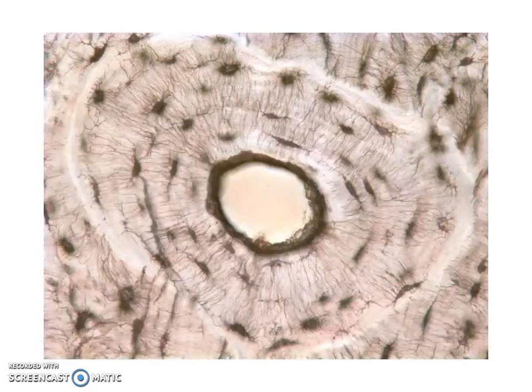So here we see bone connective tissue. This is an osteon right here, and here is our central canal. And you can see the different layers of lamella that are surrounding the central canal. If we zoom in at higher magnification, you can see that there is a space in the matrix here where we would find osteocytes, or bone connective tissue cells, if they weren't destroyed in the process of making them.